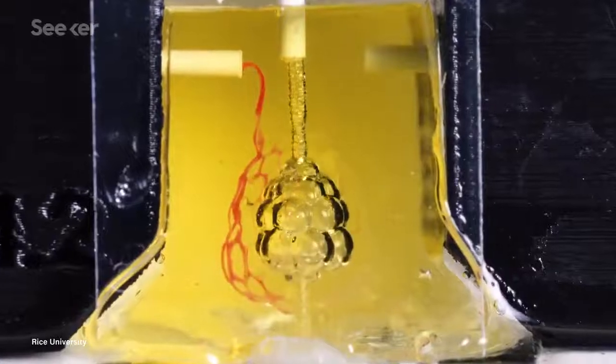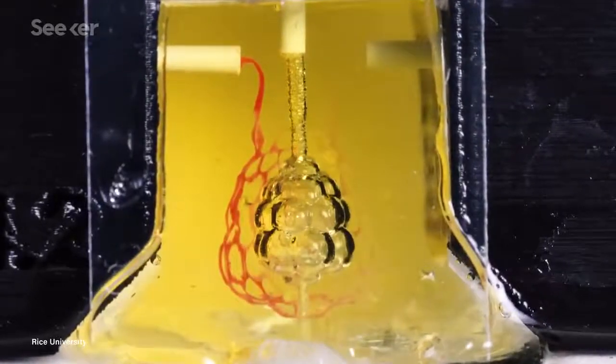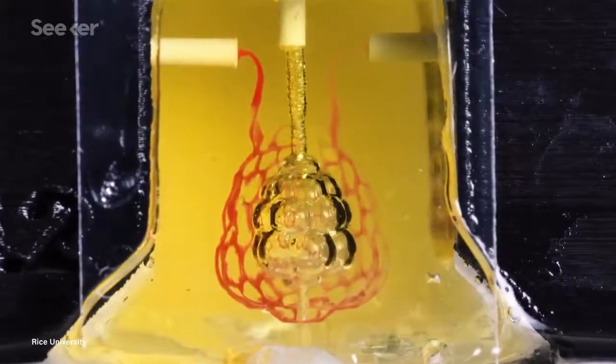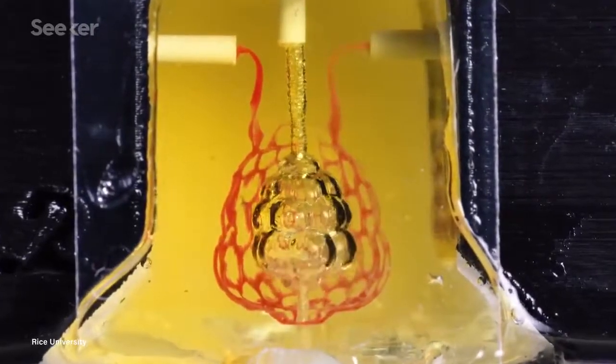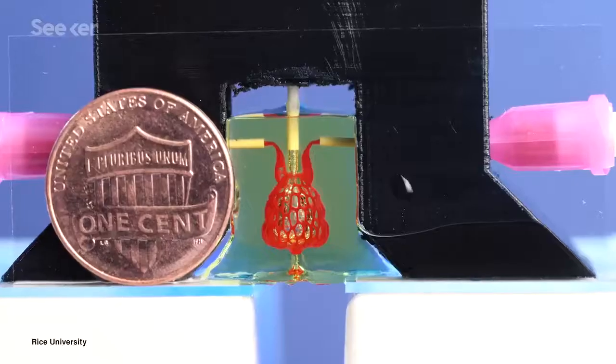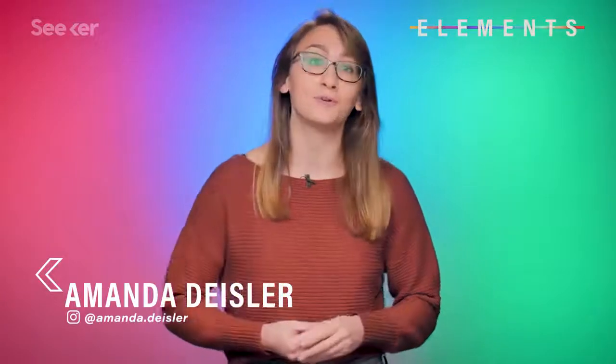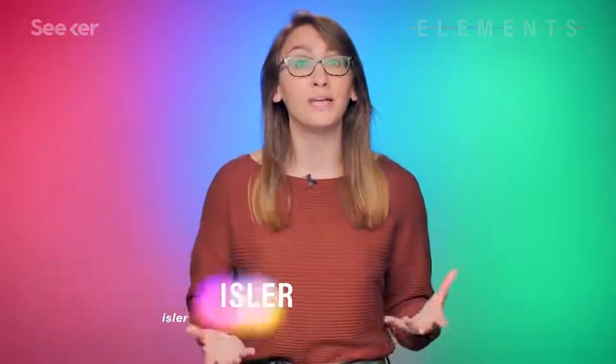You're looking at a 3D bioprinted lung-mimicking air sac that's able to pump air into airways, mimic blood flow, and was built using living cells. Granted, it's smaller than a penny, but this lung-mimicking air sac could bring us one step closer to understanding how we could replicate human organs using patient cells, which could one day help to avoid organ rejection.